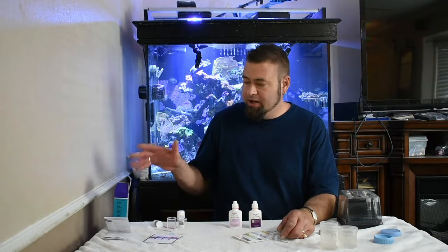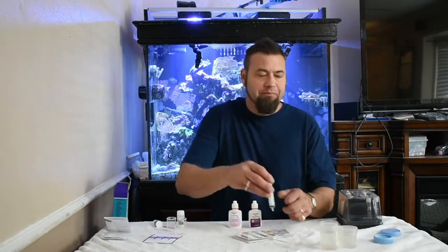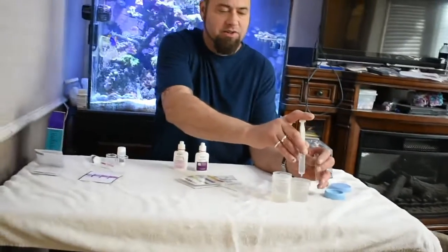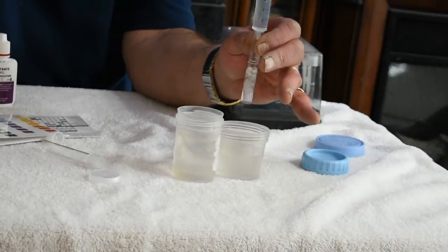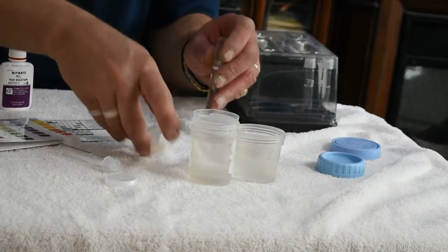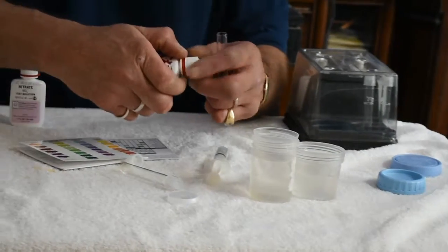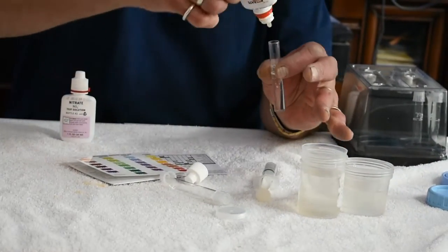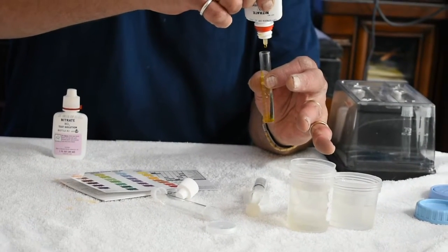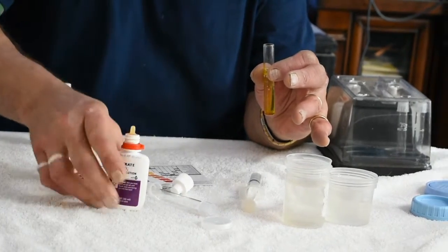The Salifert kit is a little bit more expensive. Both kits are very easy to use — I'll illustrate right here. We've got two different water samples so I'm going to do two different tests.